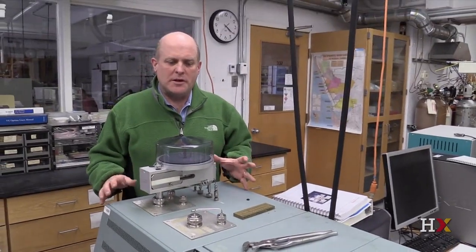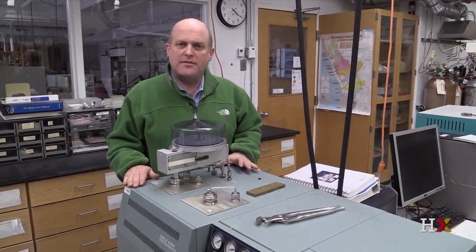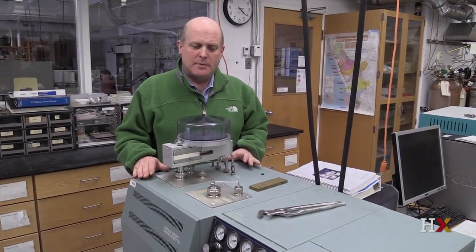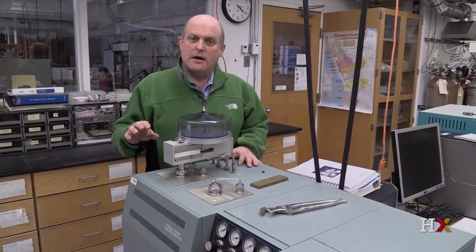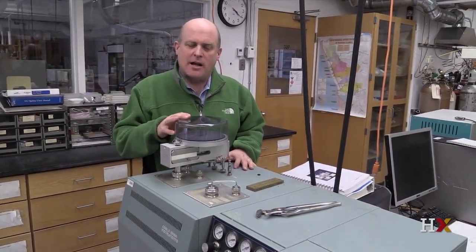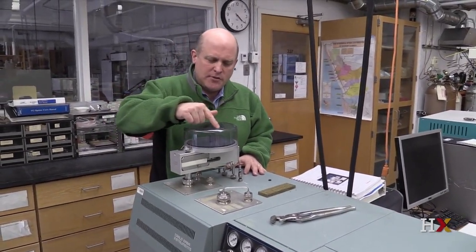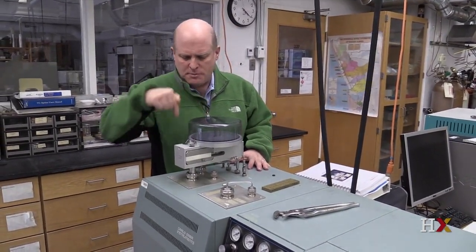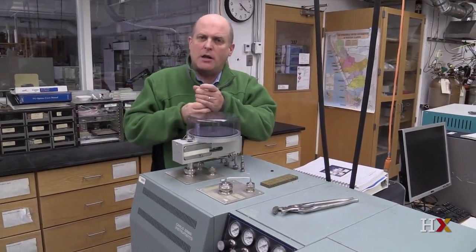Here's another tool that we use a lot in the laboratory. In this case, it's not for measuring the isotopic composition of calcium carbonate, but it's actually measuring the isotopic composition of organic carbon. It's what we call a CHN analyzer. What we do is we can put samples in this carousel right here, and they drop into the machine, and it's basically a column furnace.